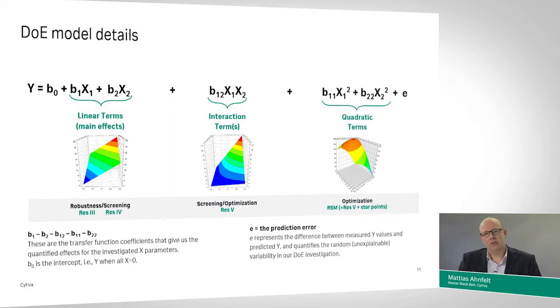And finally, going to the full complexity of a DoE polynomial would be to also add second degree curvature. That's what comes in the right-hand cartoon or response surface. So this is adding x1 squared and x2 squared to the polynomial. And that enables the DoE model to describe a maximum, a minimum, or even a plateau that we quite often encounter in protein purification.